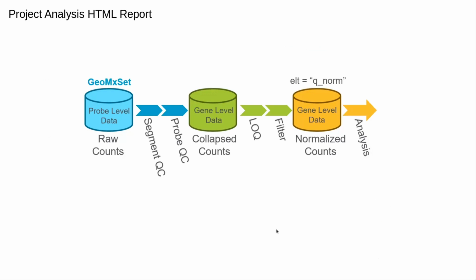So basically, the different parts of the report are some QC, some filtering and normalization, and finally a differential expression analysis. I'll just go briefly through some of these elements.